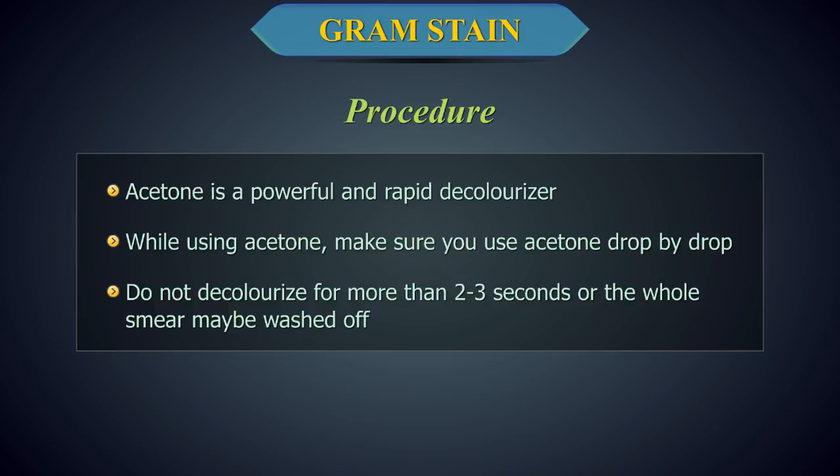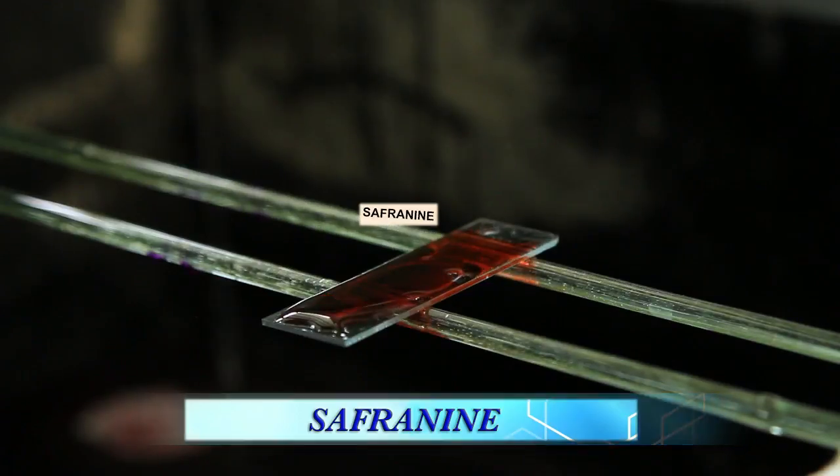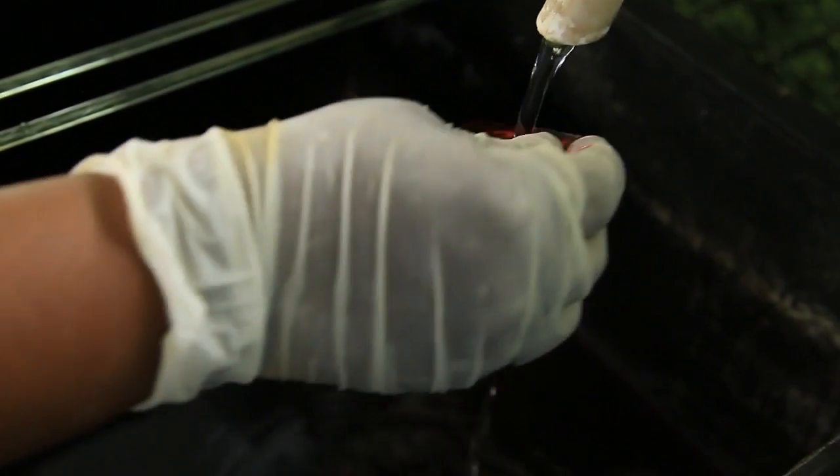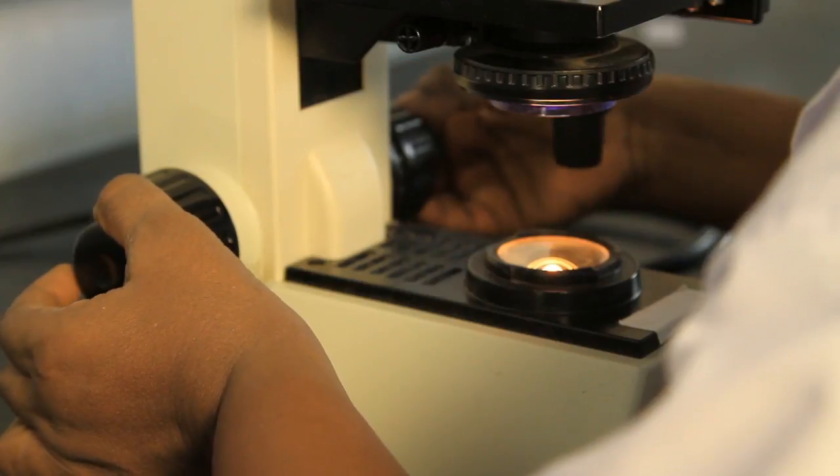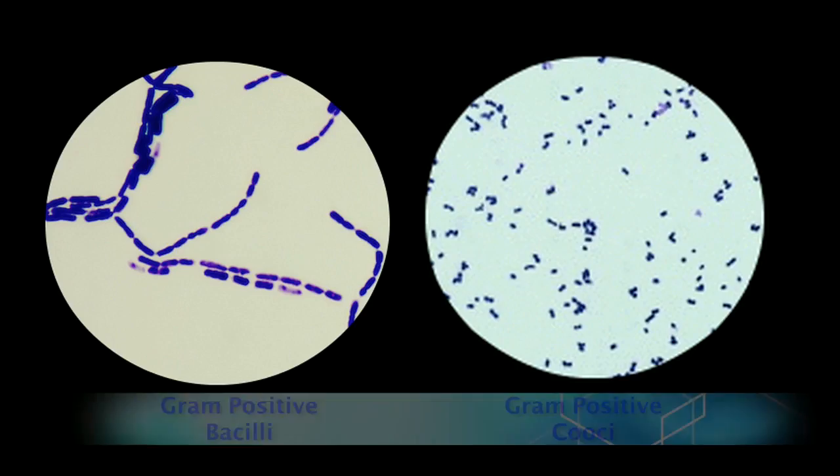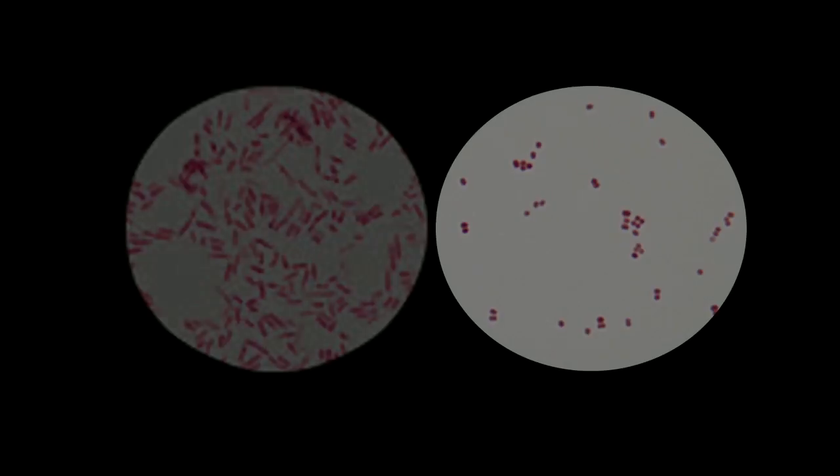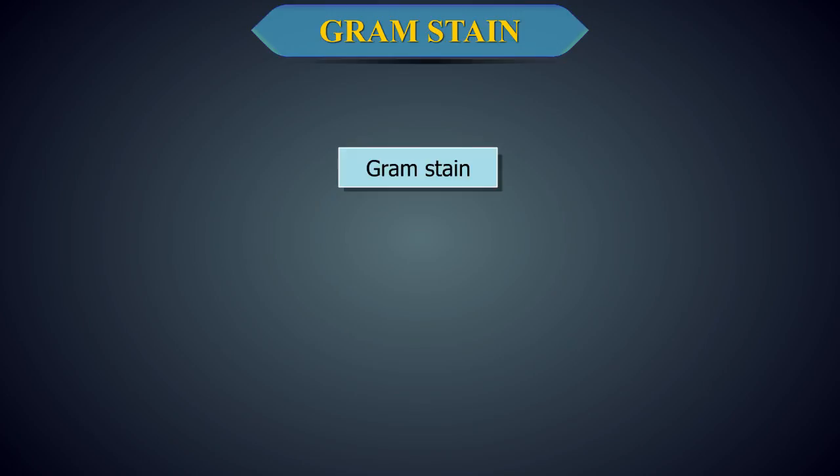Gently flood with safranin to counter stain. Cover the smear and let it stand for 30 seconds. Wash with a gentle stream of tap water. Let the slides air dry and blot gently. View the slide using a light microscope under oil immersion. Bacteria which retain the positive stain are stained purple and are called gram-positive bacteria. Bacteria which retain the counter stain take up the red color and are called gram-negative. Gram stain can therefore be called a differential stain because it differentiates between gram-positive and gram-negative bacteria.